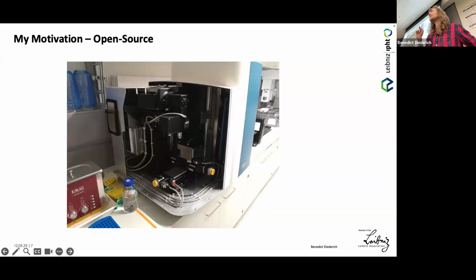It's now basically a 500,000 euro piece of scrap heap, because the software that was running this device was broken during a flashing, an upgrade process, and then the company went bankrupt. Literally all the components are perfectly fine. It's just that you cannot operate it anymore.